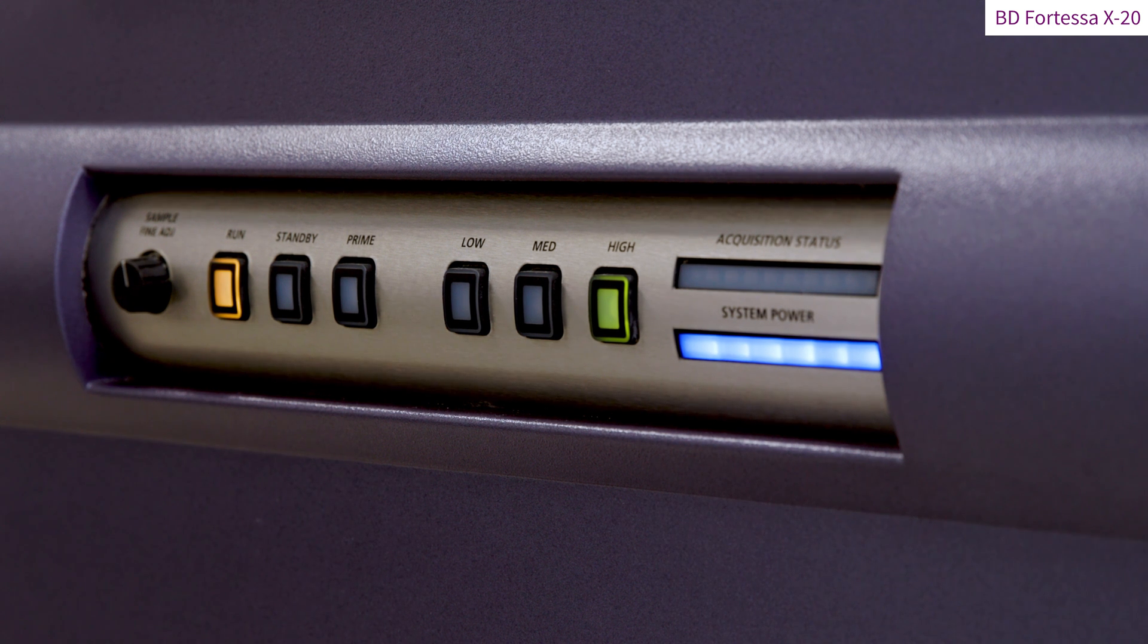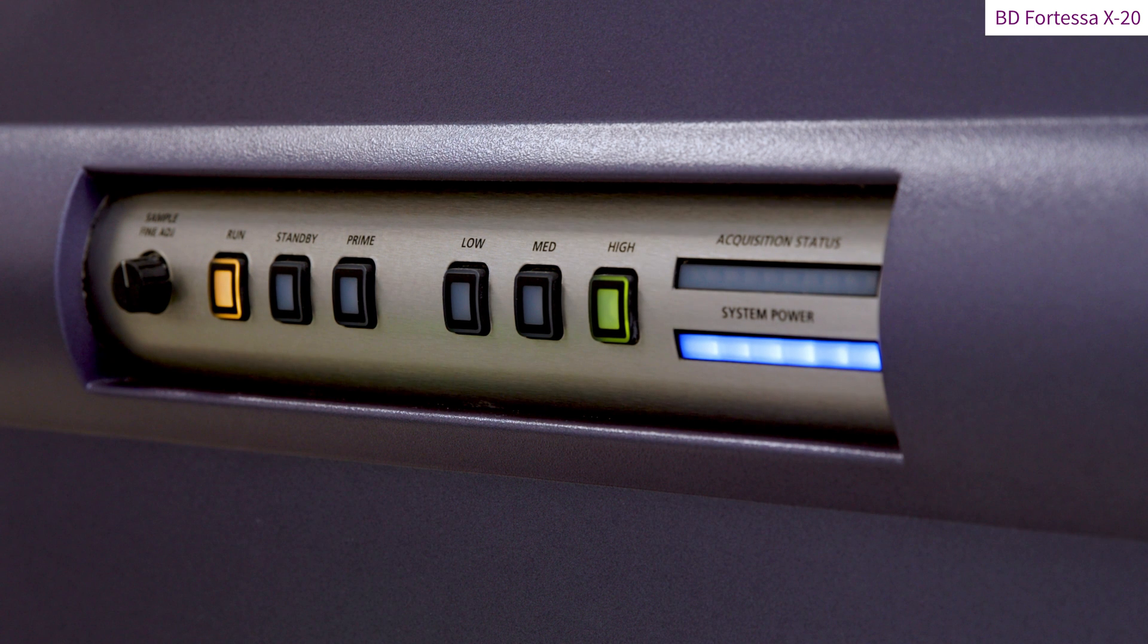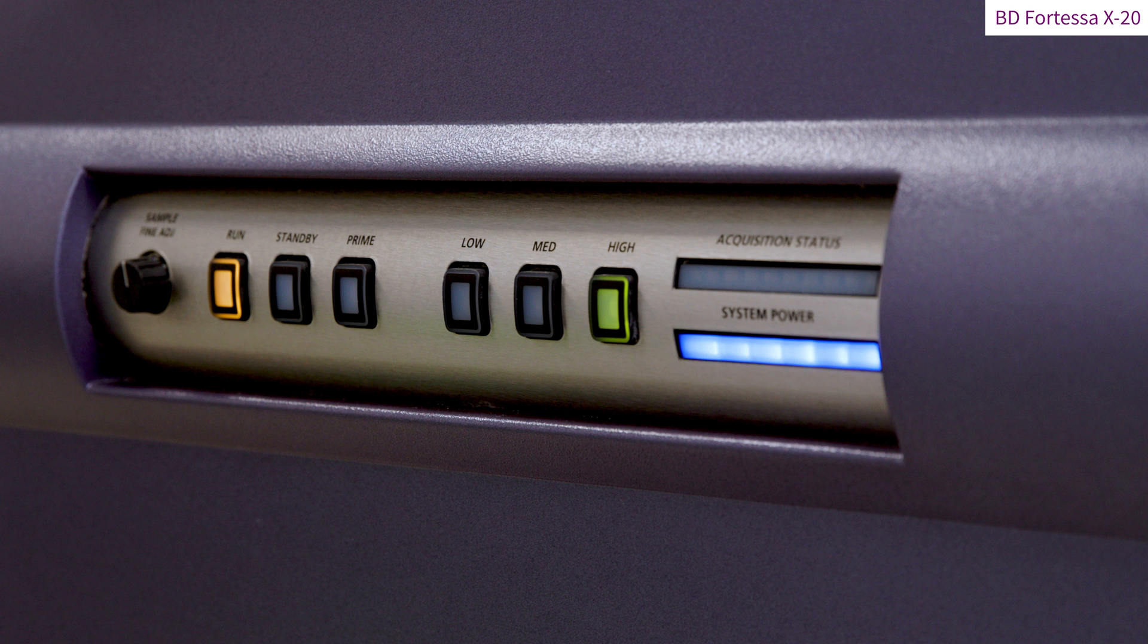When the run button turns to an orange light, this indicates the acquisition cannot be performed. This might be linked to the arm supporting the sample tube being left on the side or to a clog affecting the Fortessa fluidic system.